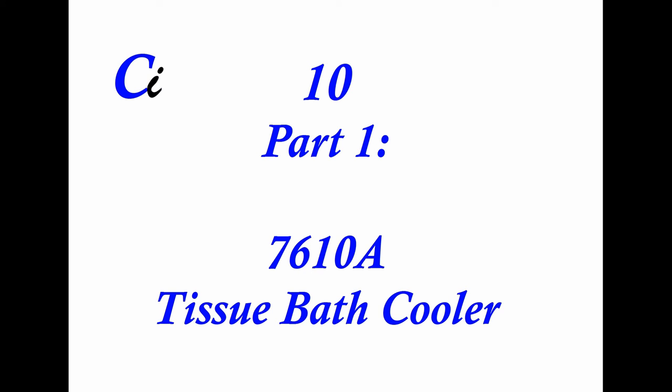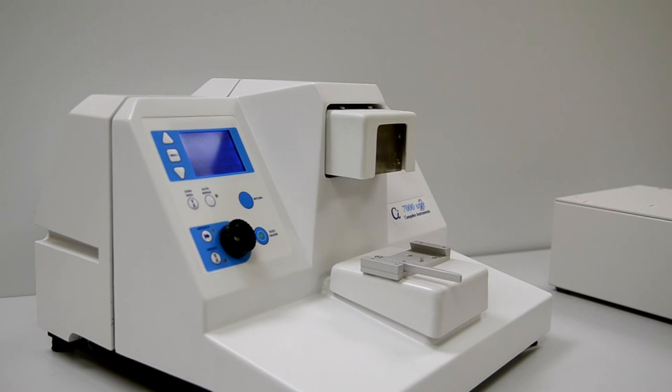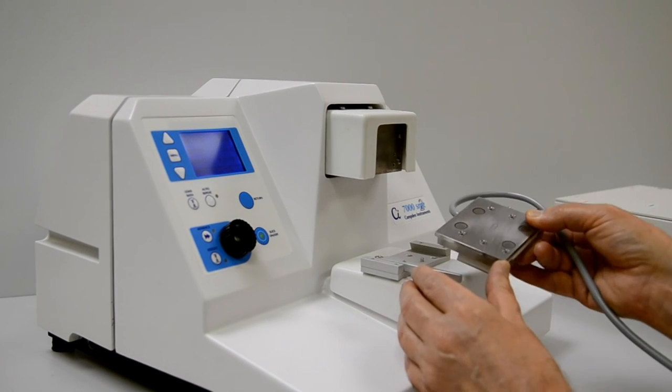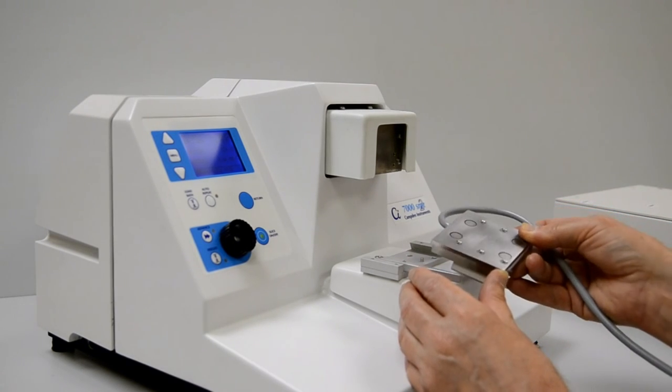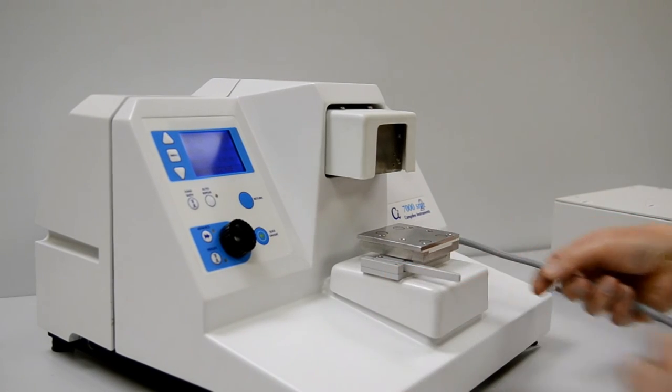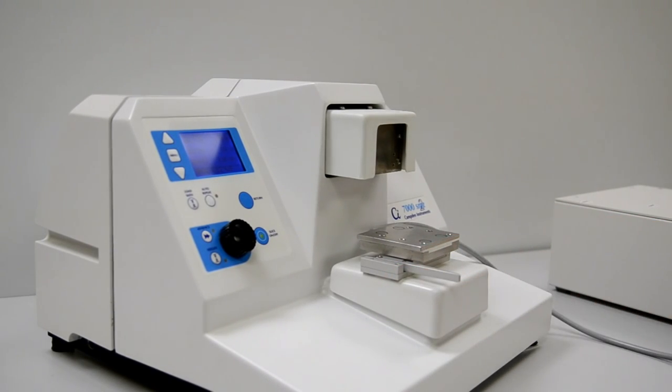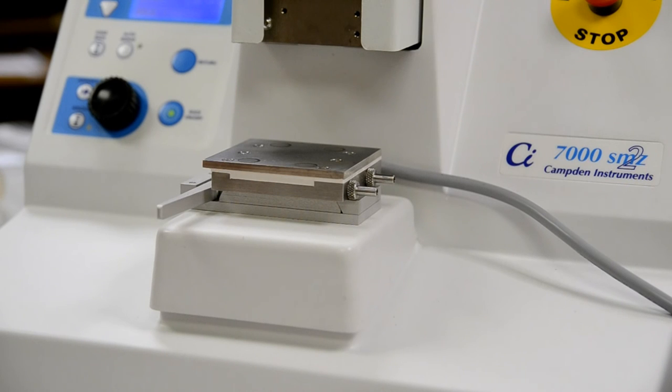The 7610A cooled tissue bath was mentioned briefly earlier in this video. This fits to the slicer in place of the ice surround outer bath and accepts the same standard inner bath and specimen holders. Once fitted, it will allow you to control the temperature of the fluid in the inner bath, thus helping to prolong the viability of the slices being cut.